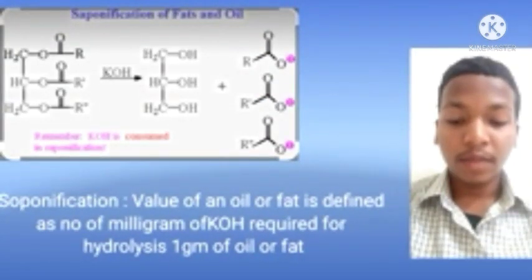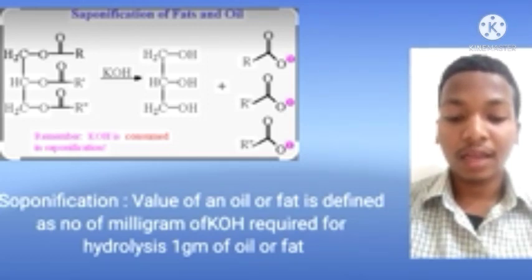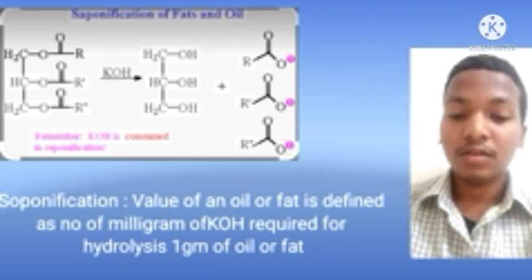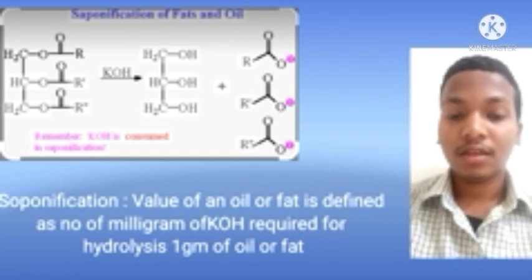Theory: base hydrolysis of ester is called saponification. Oil or fat upon hydrolysis in presence of alkali KOH forms glycerol along with K salt of long chain fatty acid called soap. You can see in this reaction how a fat reacts with alkali KOH.